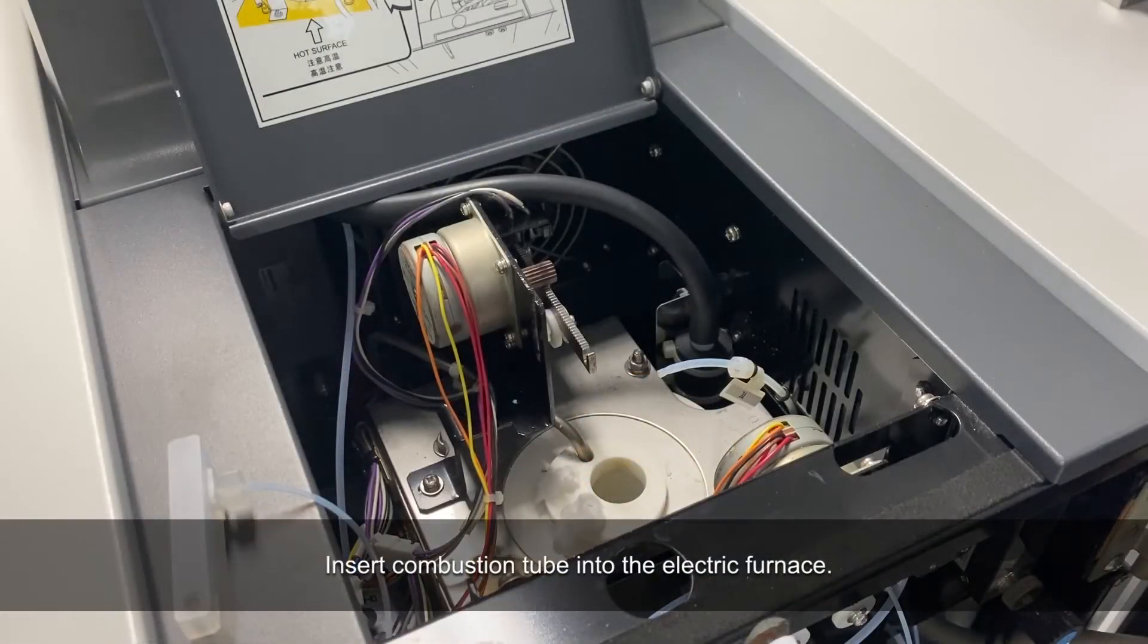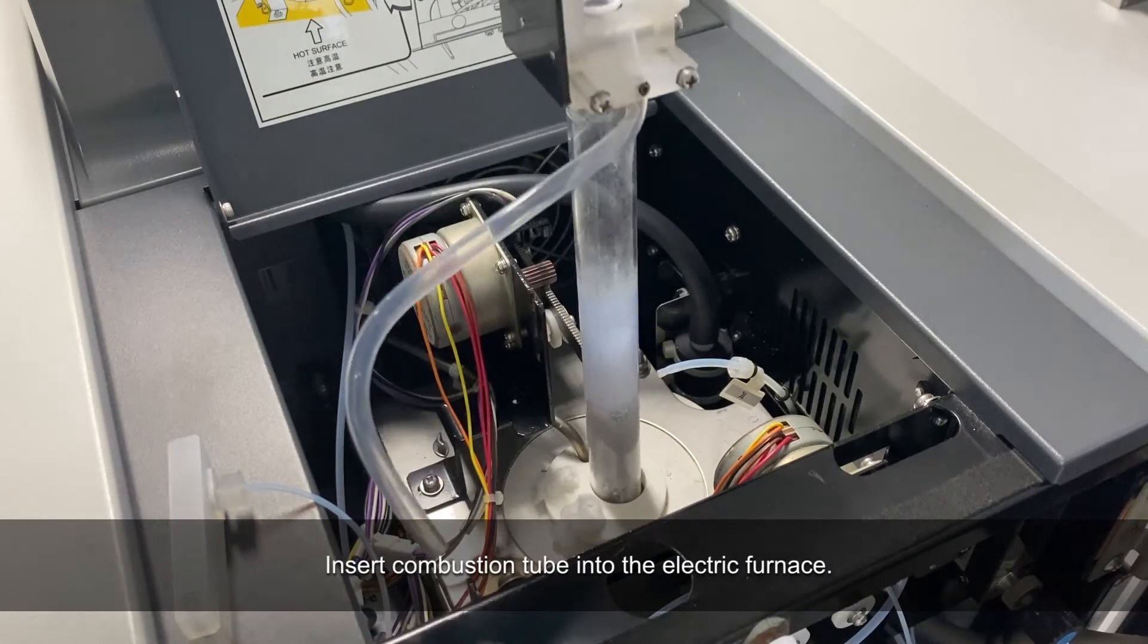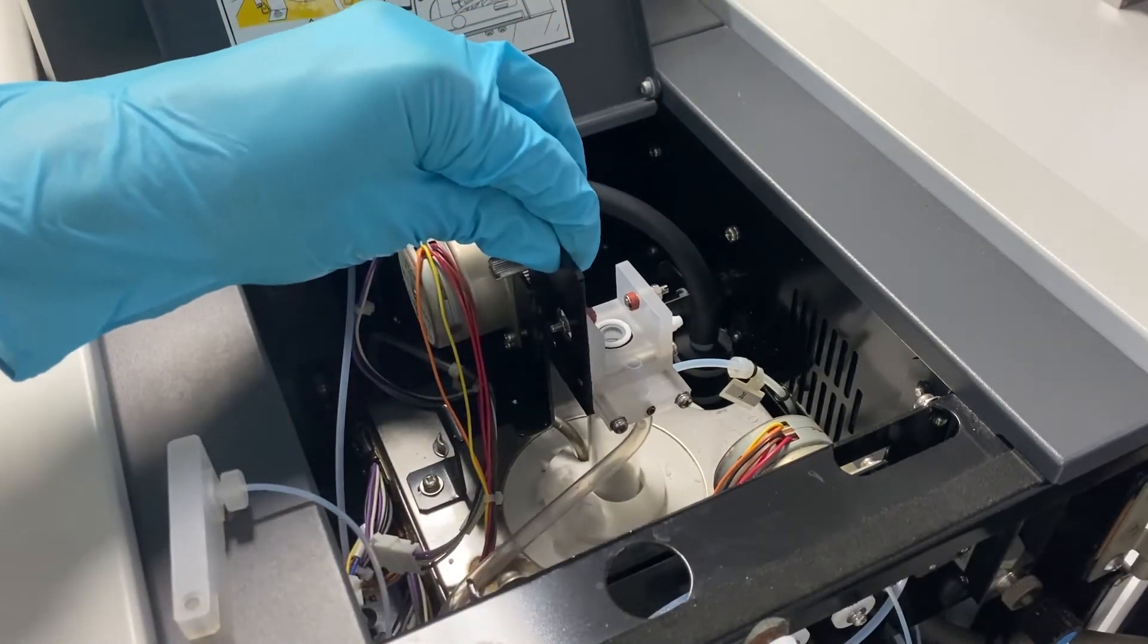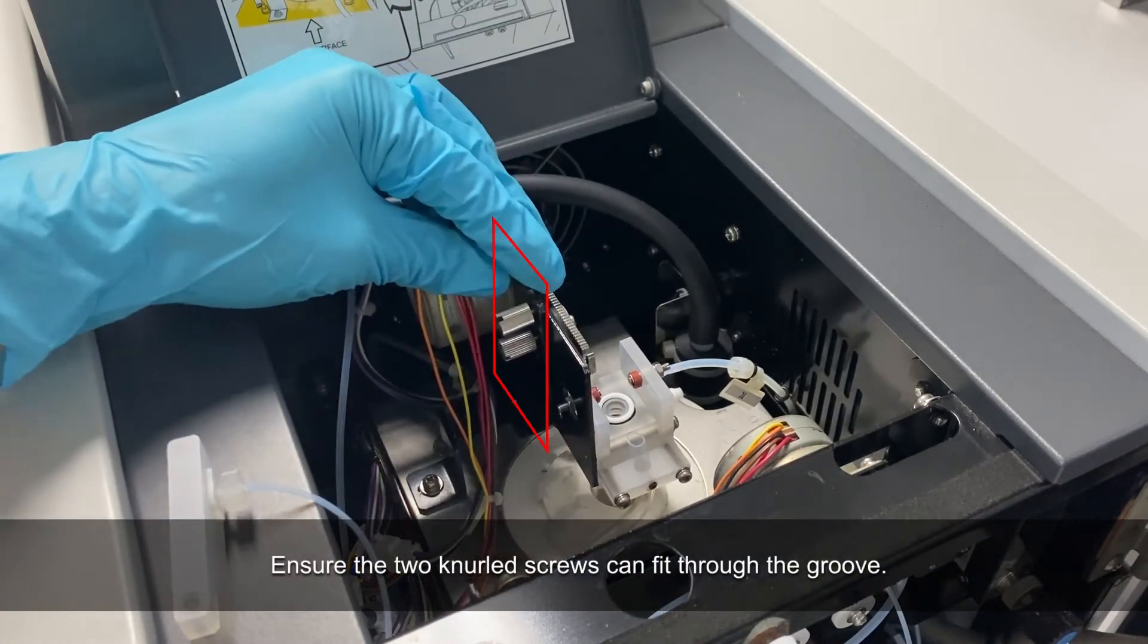To place back the combustion tube, insert the tube into the electric furnace. Ensure the two screws are able to fit properly through the groove.